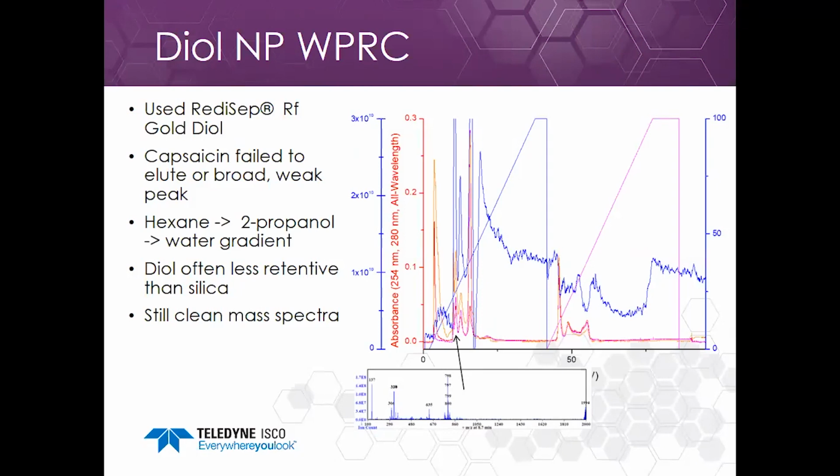Why would I want to use diol over silica? Well, diol is a weaker column. It doesn't retain compounds as strongly as silica gel.